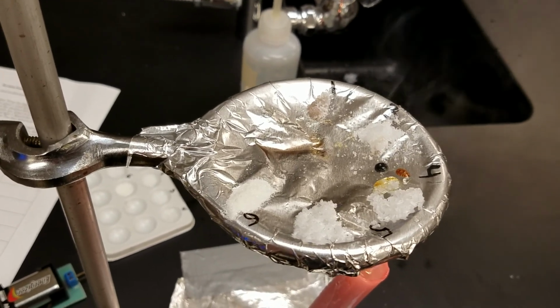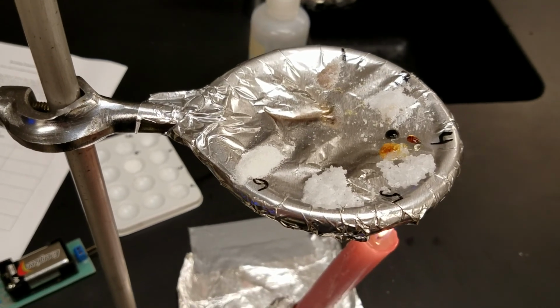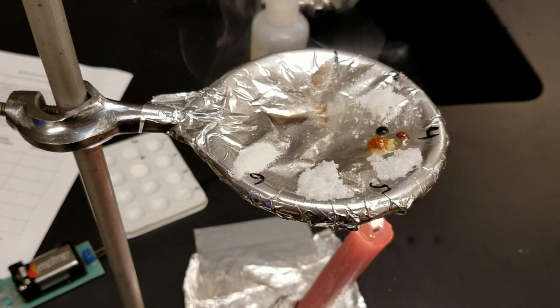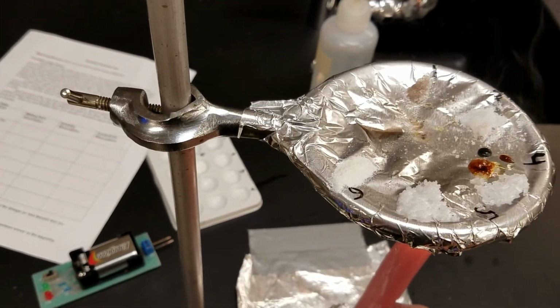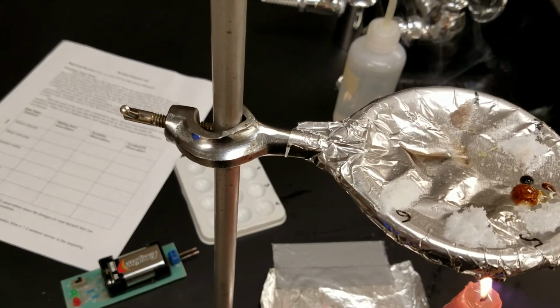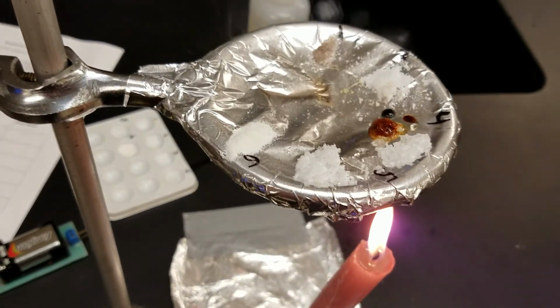And what you're seeing happening is the sugar, the sucrose, which is number 4, is actually starting to get hot because it's so close to that flame, and it's turning brown and melting already. Potassium iodide, on the other hand, is doing nothing, a lot like the calcium chloride. So let's go ahead and move this to right under the sucrose.